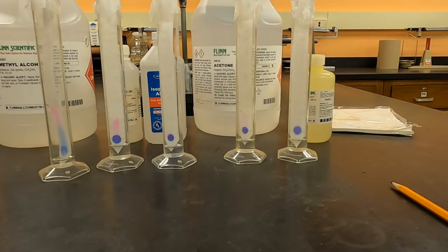Now that these are all set up, we'll watch them develop and see what happens as the solvent moves through the mixture.